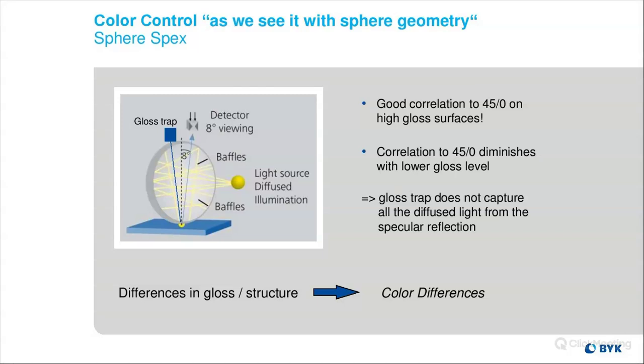And so now as the light scatters, that gloss information gets sent back to our gloss trap, so it captures that gloss data. And so now you can take into account the gloss and surface structure into the color measurement, and get a similar set of values that correlate to your visual representation. So you can use the instrument for two purposes, let's say.